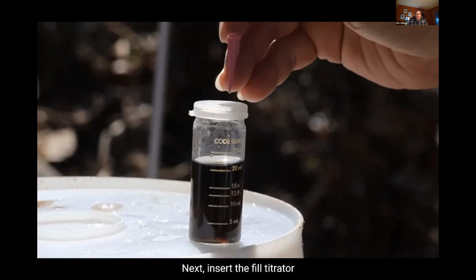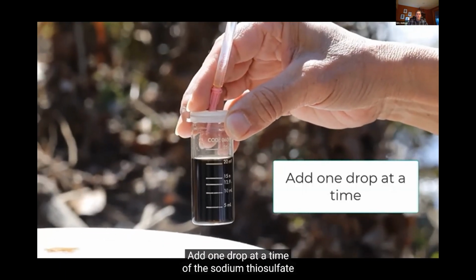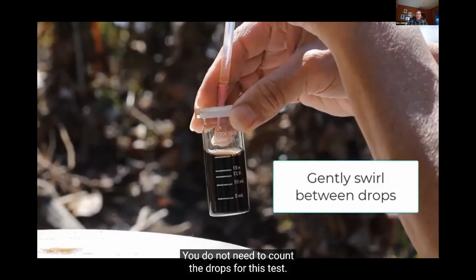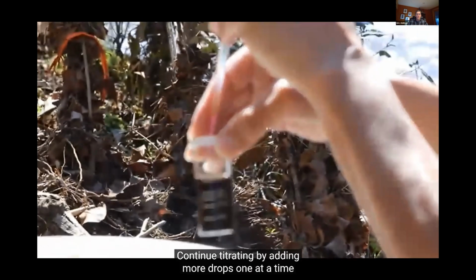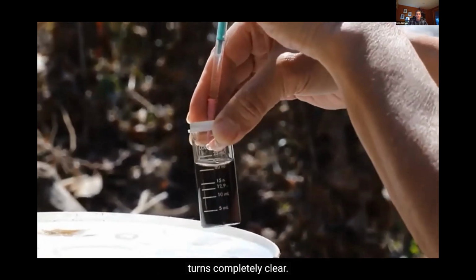Next, insert the filled titrator into the center hole of the titration tube cap. Add 1 drop at a time of the sodium thiosulfate into the titration tube. Gently swirl the tube between drops. You do not need to count the drops for this test. Continue titrating by adding more drops one at a time until the dark blue or black solution turns completely clear.